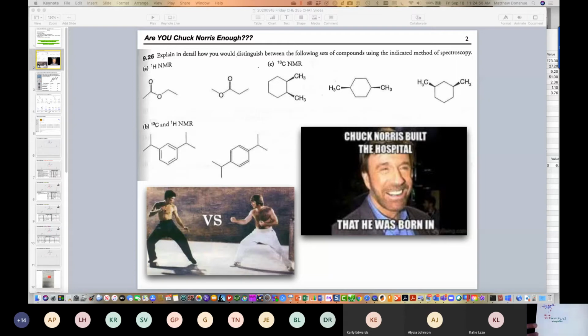I would say in the strictest sense, you probably could, but just in terms of the exercise, not really, because the order you might want to put them in is how you would read them in the spectrum, but it would be really hard to do that without a deeper understanding yet of chemical shifts. So just as long as you have the right numbers, it really doesn't matter what order we put them in.